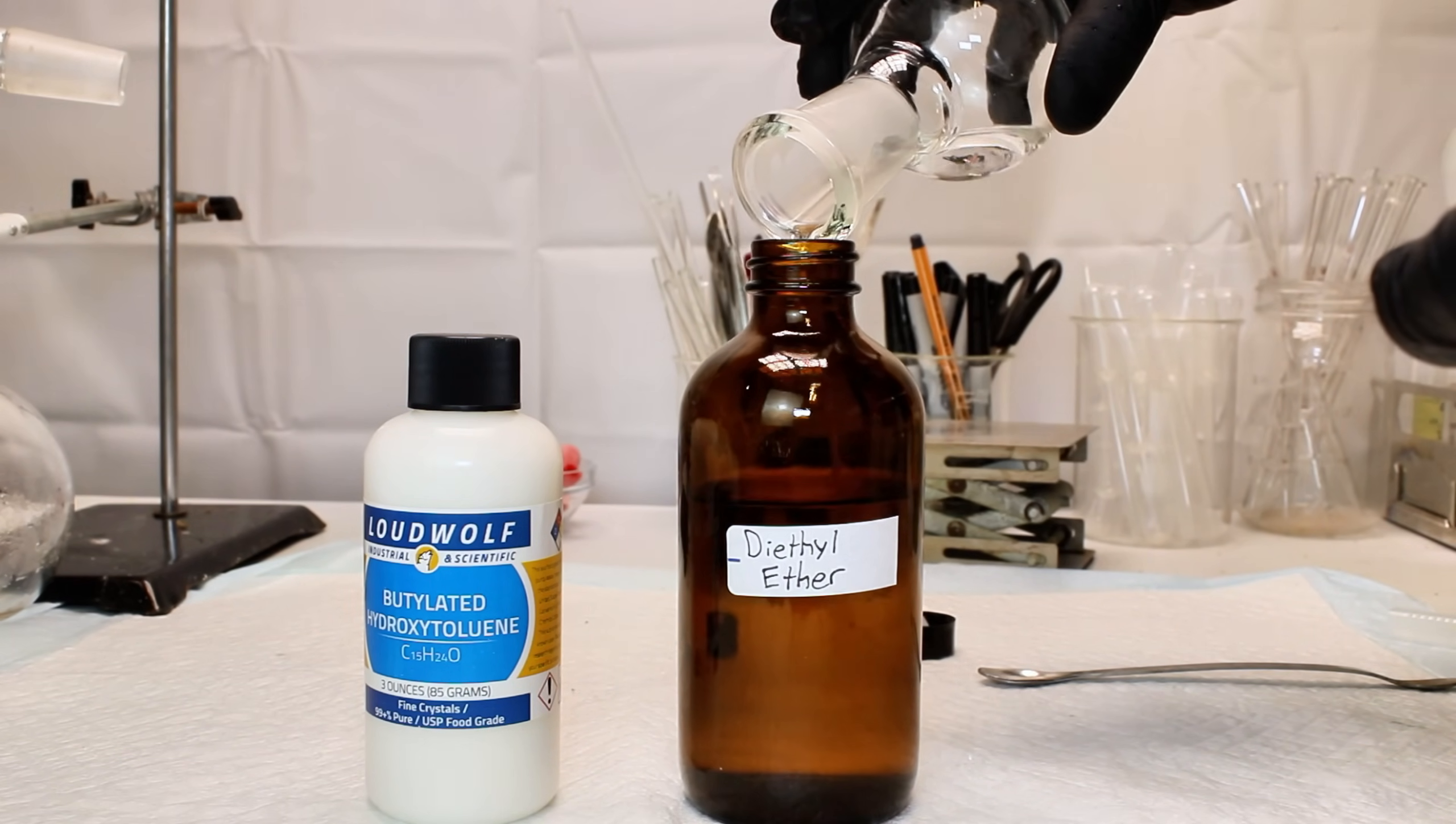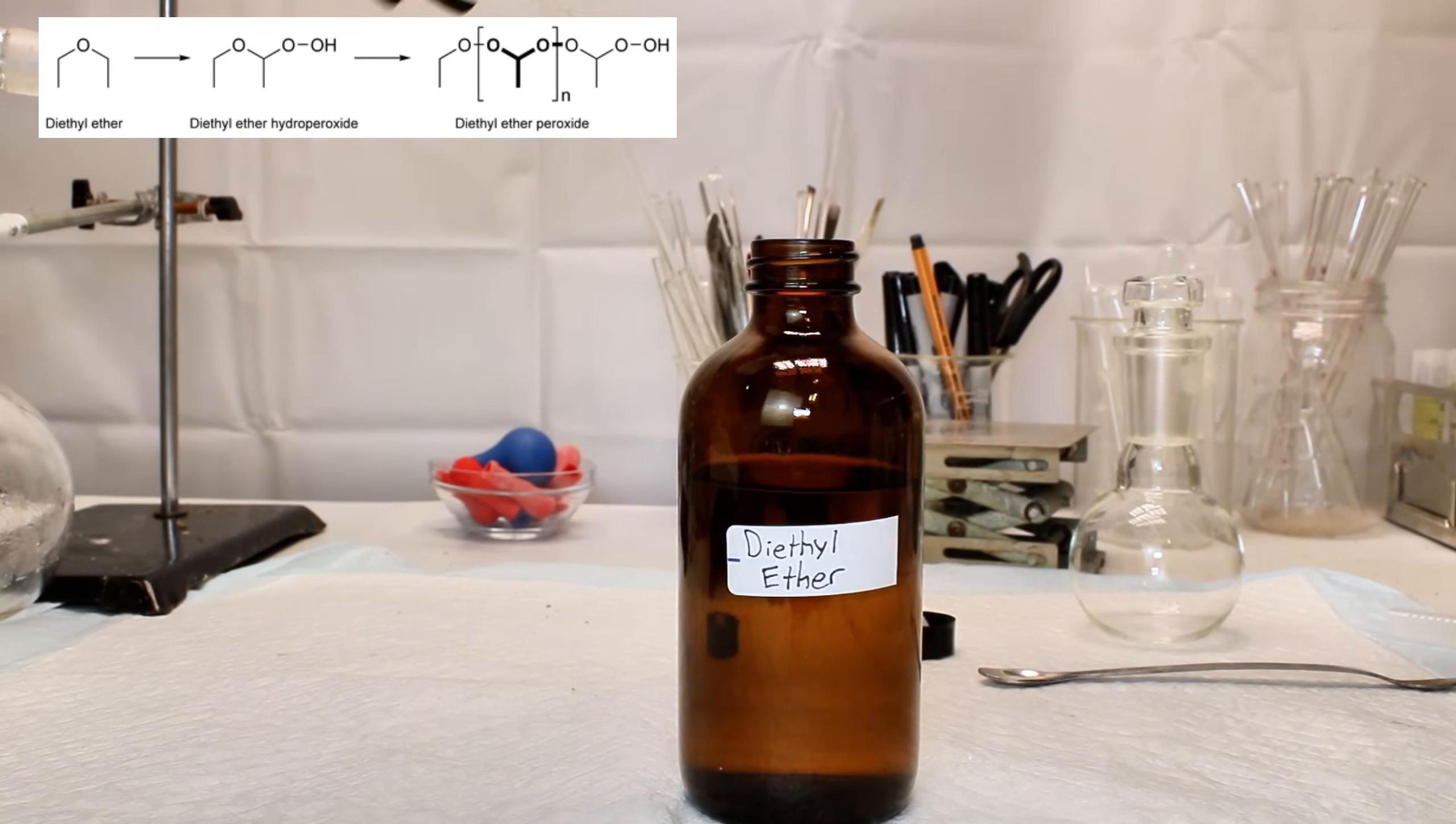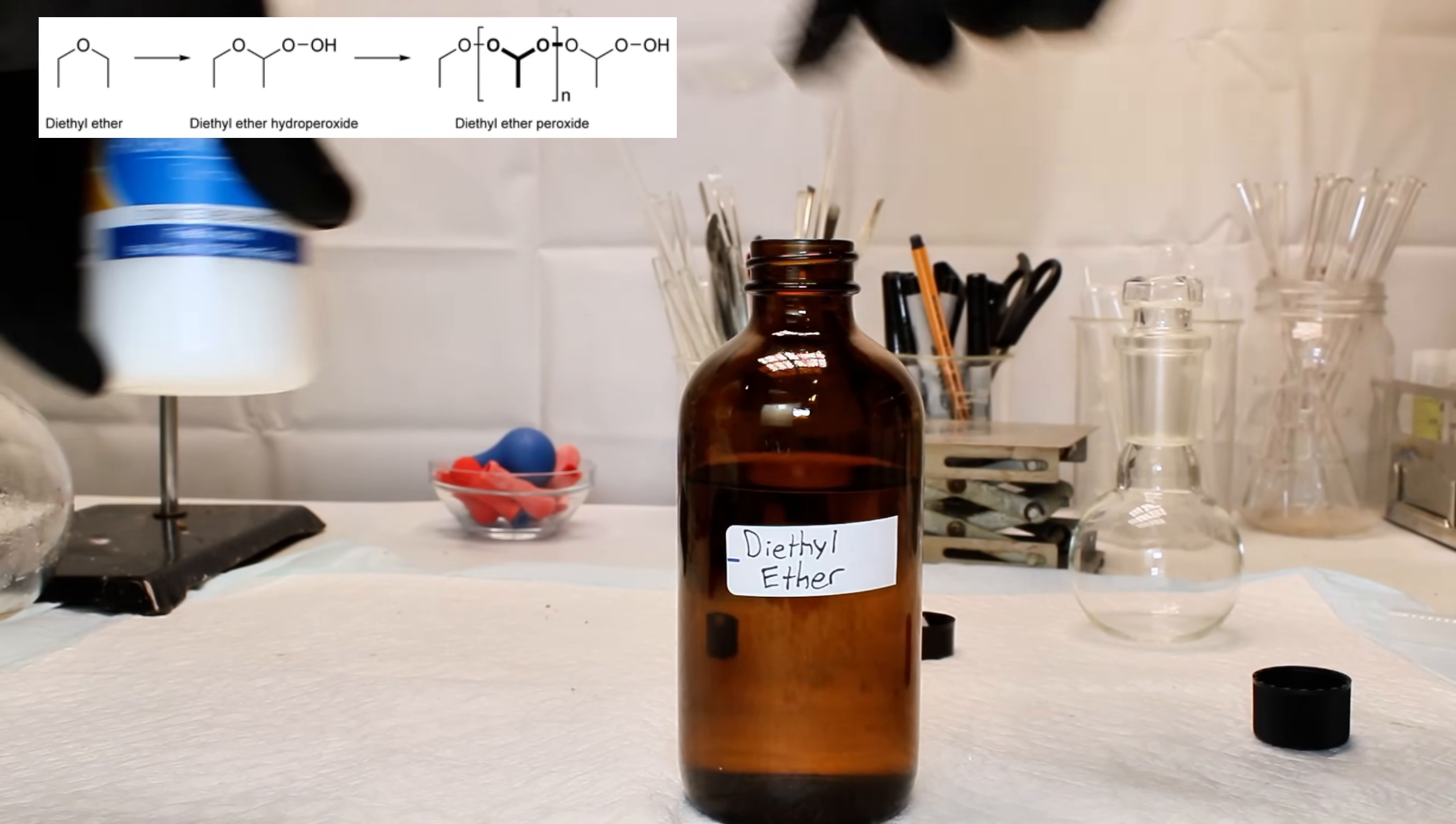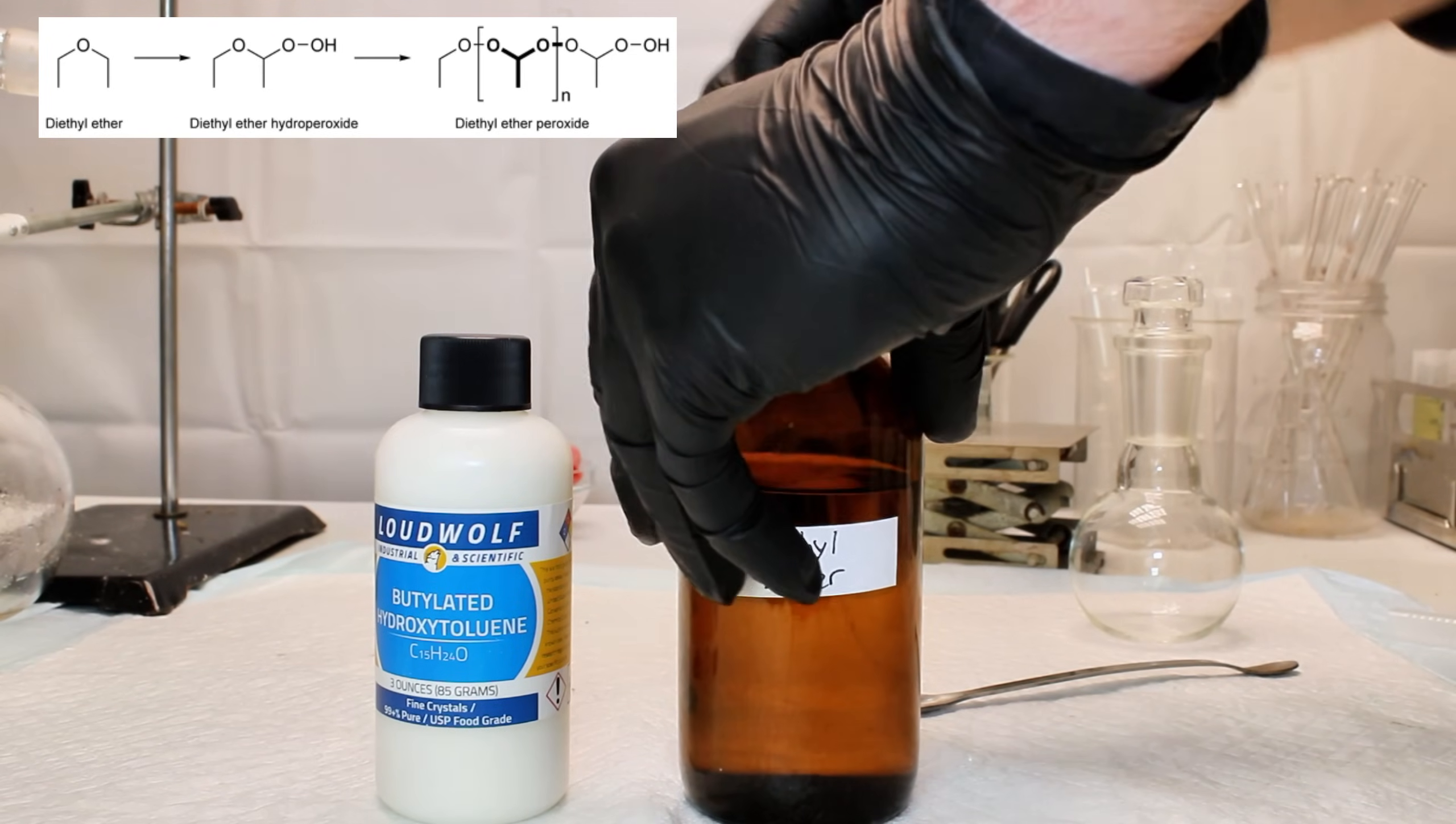That said, these final steps are important, as diethyl ether will very slowly form explosive ether peroxides over the course of several months. The ethanol helps to inhibit this decomposition, while the butylated hydroxy toluene is a reducing agent, and it will destroy these peroxides as they form.